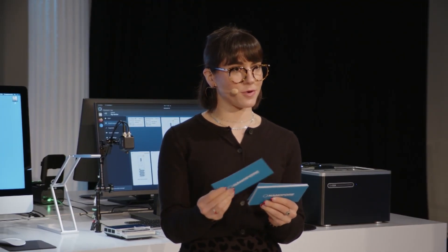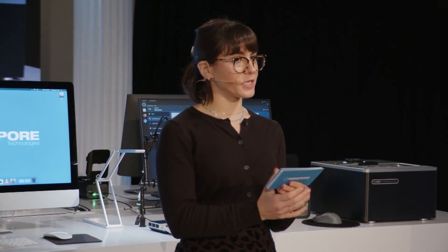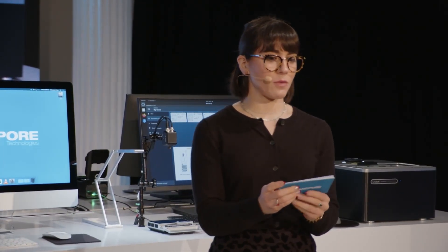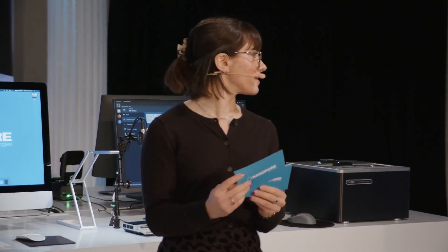Everyone knows that a well-prepped library is important for Nanopore sequencing. I want to take some time to talk about what's new with Voltrax, our portable device for automated library preparation. For this I want to invite up Beth Lodge, our senior lead on Voltrax chemistry to the stage. Welcome Beth.